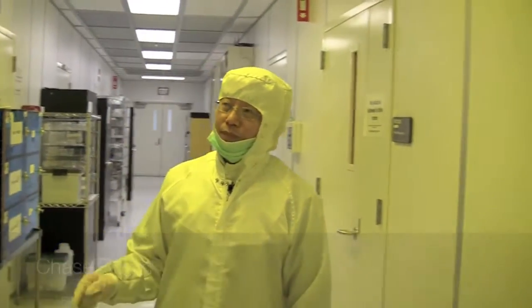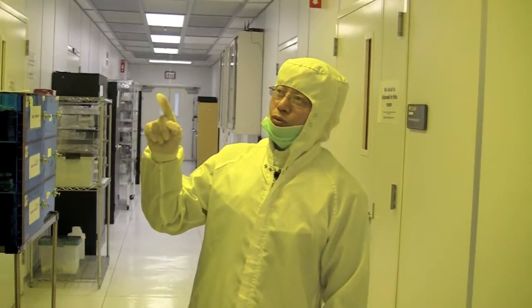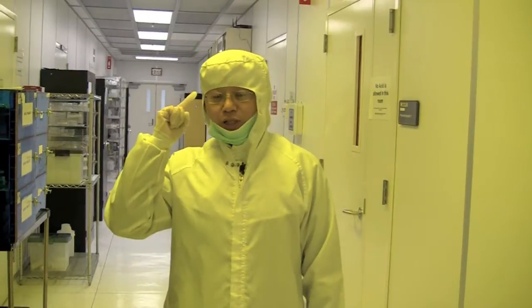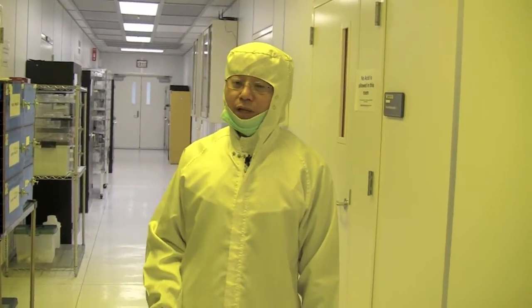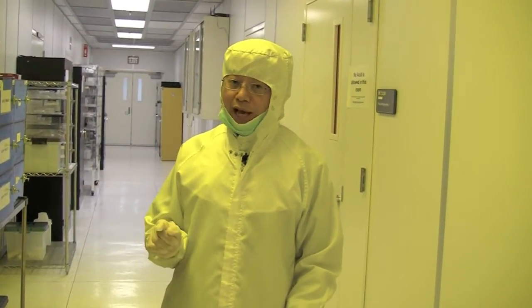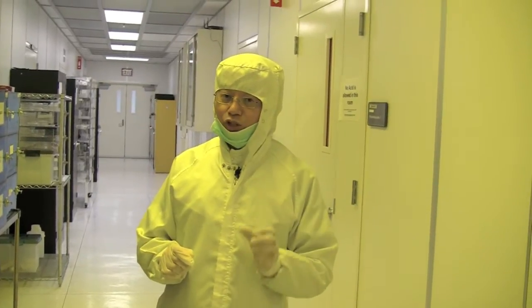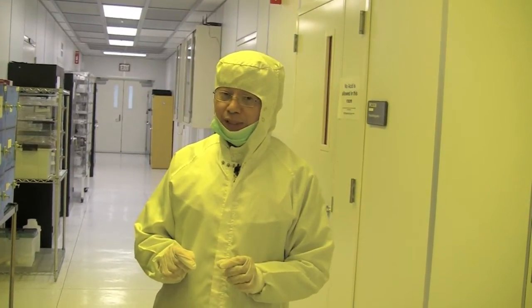So this is the chase room. The room number is 2337. Keep this in mind. The chase room is to store chemical gases, water supply, chiller, vacuum pumps, and so on.